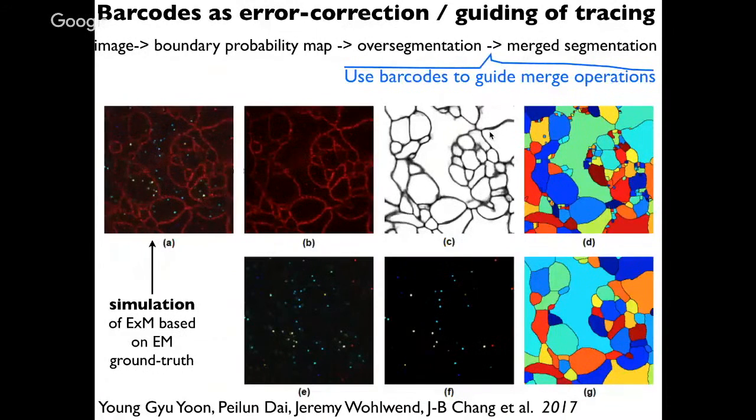So this is also something we've been trying to evaluate in computer simulations, where we're starting with data sets that are collected, in this case from Jeff Lichtman's lab, in a published paper, showing the reconstructed geometry of a small volume of neuropil using the electron microscope, and then simulating what that would look like if we took that same volume and imaged it with expansion microscopy with this 20x form as it currently stands, roughly, in terms of the performance of labeling and resolution that it can get.